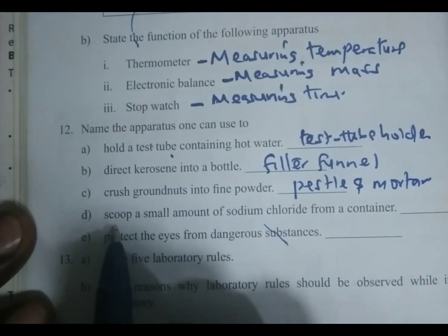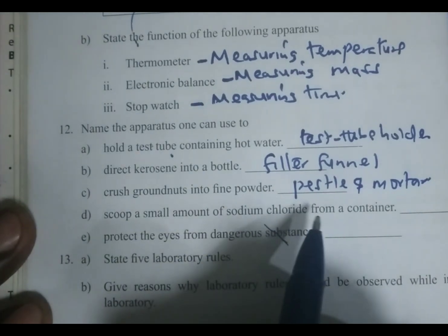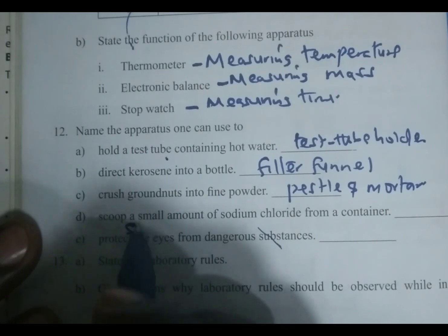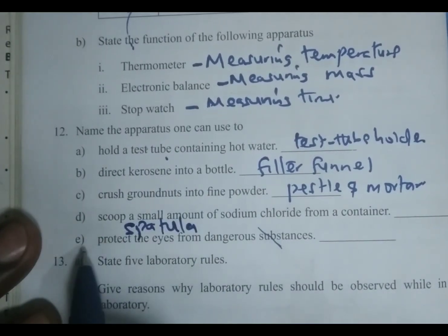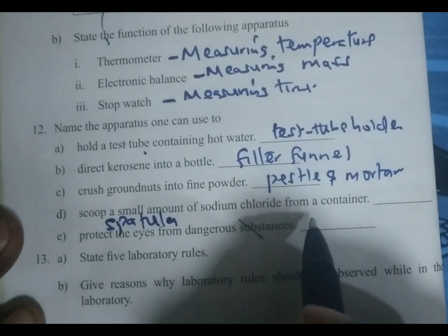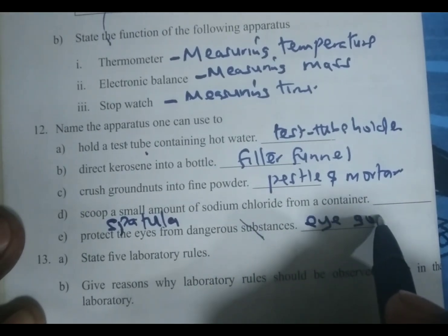Next we have part D, the apparatus that is used to scoop a small amount of sodium chloride from a container. The apparatus that we use when scooping solid substances is called the spatula. Part E, protect the eyes from dangerous substances. We use eye goggles.